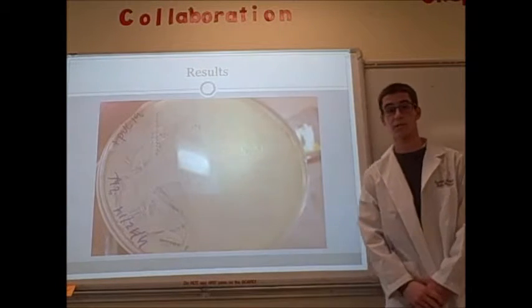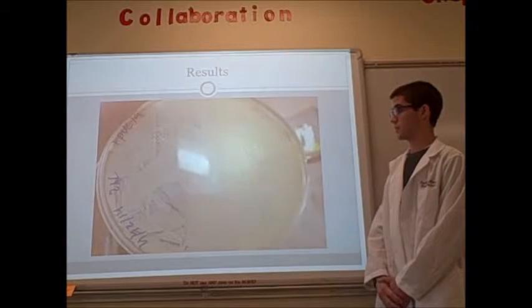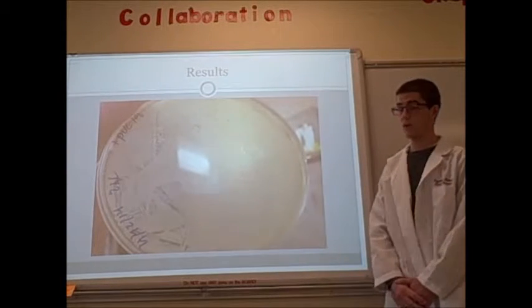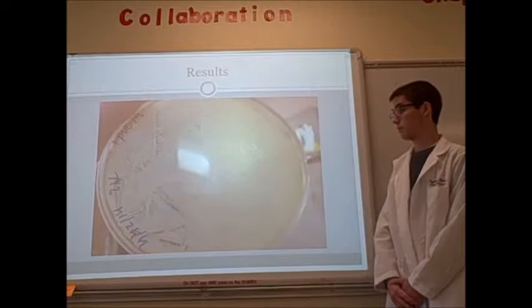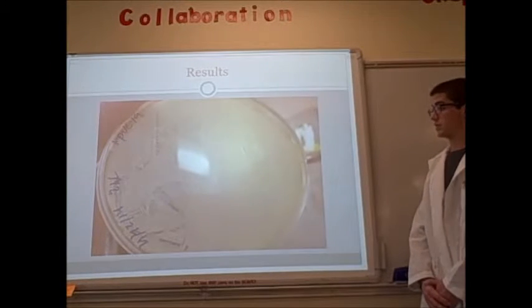Here is the pUC19 initial dilution, which is a full lawn. This is completely expected because there was no dilution done with this bacteria, so it should be growing in a full lawn. However, there were no blue areas, which indicates that there was a problem with either the IPTG or X-gal solution.